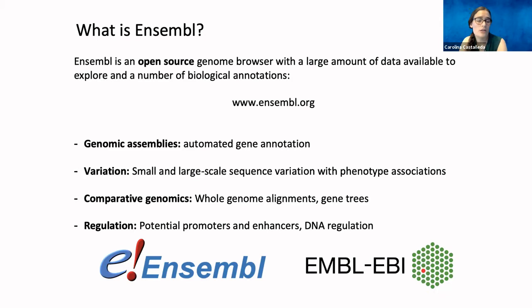And it also has a lot of annotations on potential promoters and enhancers, which turn out to be DNA regulation. So you can also see whether the specific variant that you're looking for has an impact in all these matters.